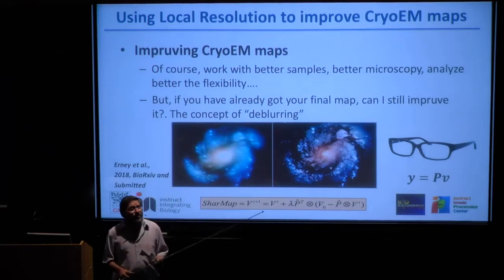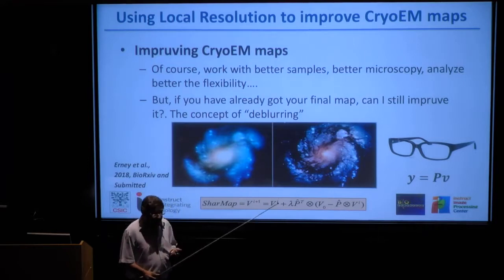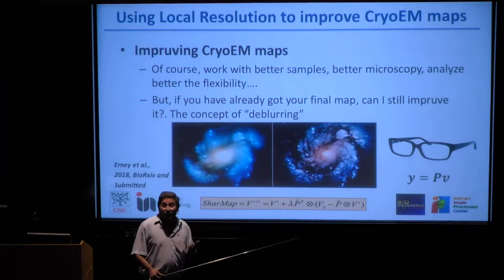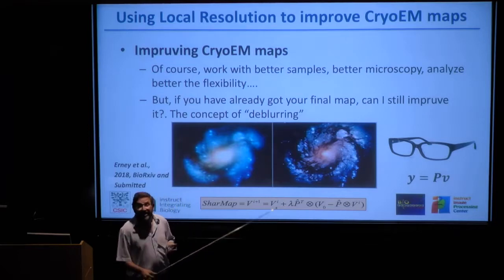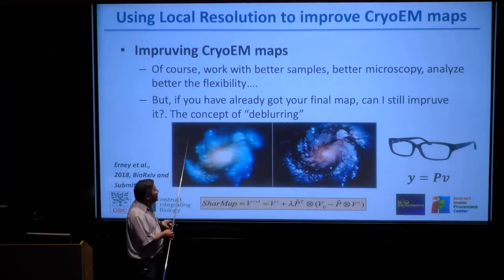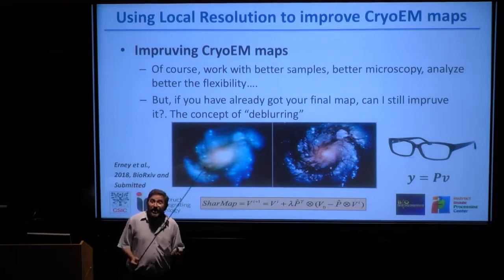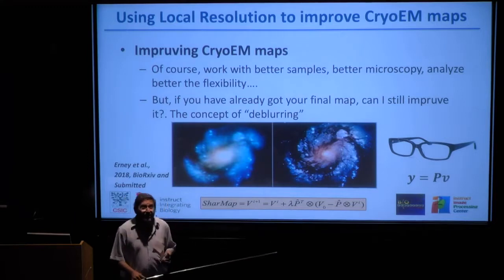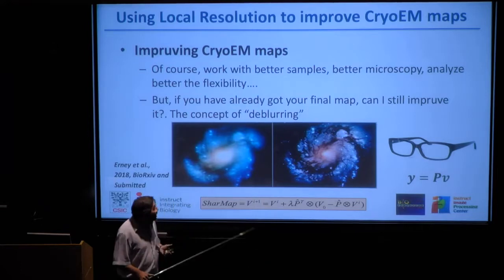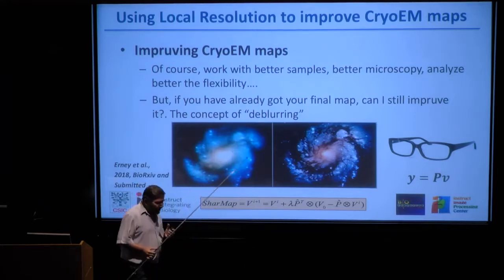In the case of the Hubble, and in general, we are able to do a good deblurring when we know well the blurring function. In the case of this, it was simple. Get a distant star that doesn't have anything around, is a point, and look how that point gets translated into the telescope. Well, we didn't have something like that, so we did the following approach.